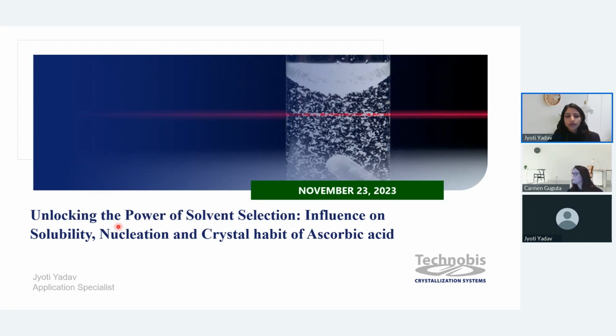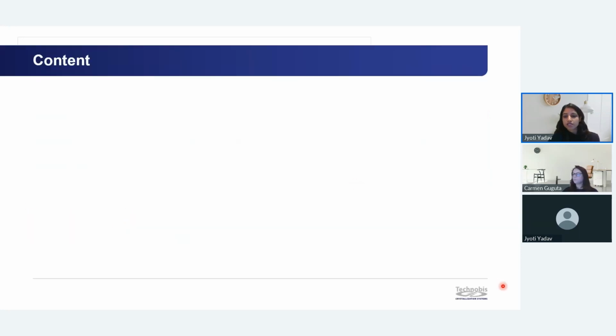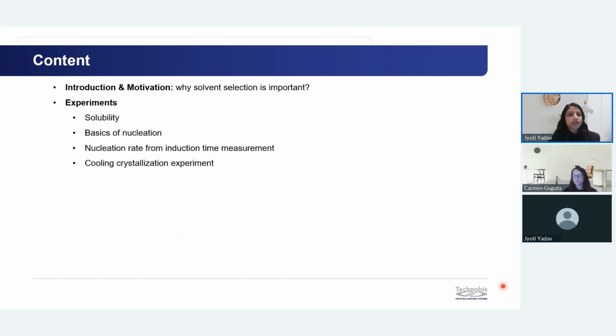So during this webinar, first I will give a brief introduction about the compound ascorbic acid, and then the motivation behind this work, that is why solvent selection is important. Then coming to experiments, I will first share the experimental procedure to determine the solubility. Then before going to nucleation rate, I will discuss the basics of nucleation, which will include what is nucleation, different types of nucleation, and different methods to determine the nucleation kinetics.